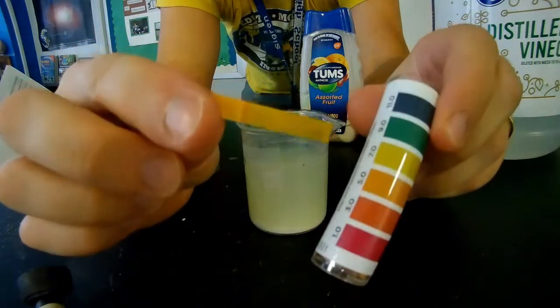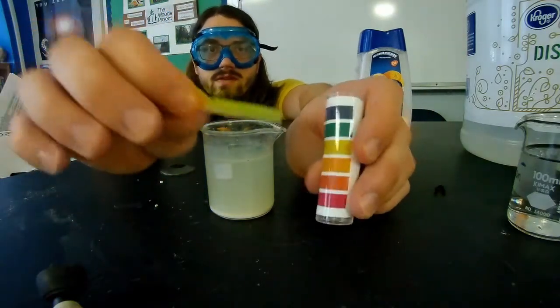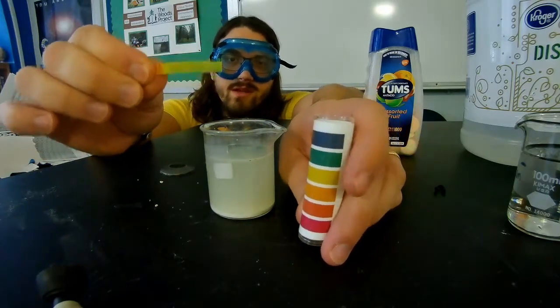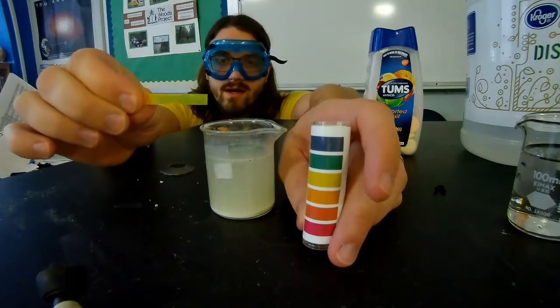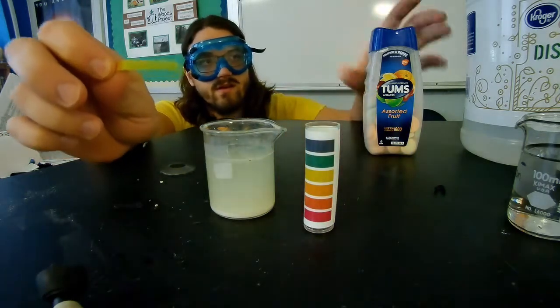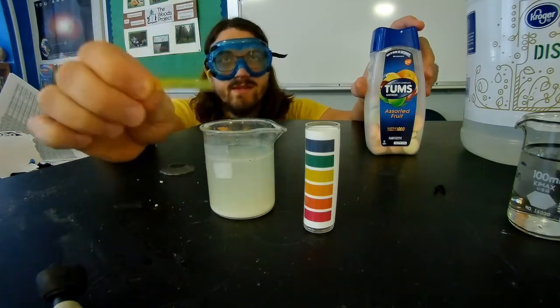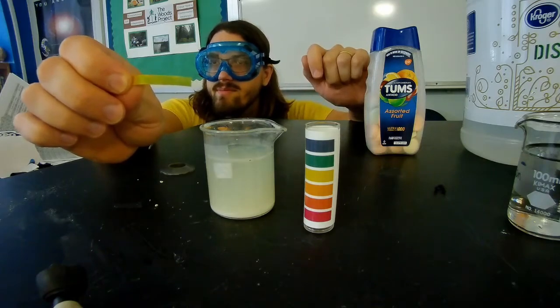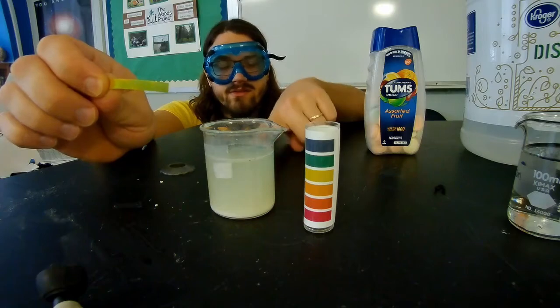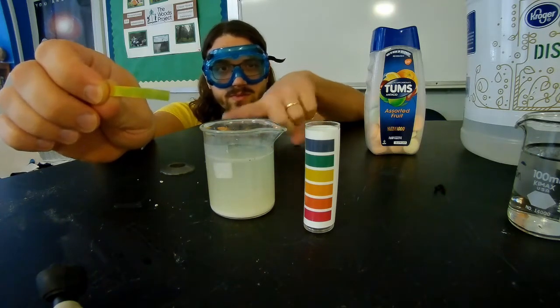And let's see, what do you think the pH is? Alright, that was kind of an interesting reaction, but the longer I waited and as the paper dried and some of the water dried, there is a tendency for some of these bases, when they are solids that are dissolved into water, the water kind of blocks seemingly the function of the pH strip a bit, as sometimes there can be a bit of a chemical reaction between water and a base, and that disrupts the pH.